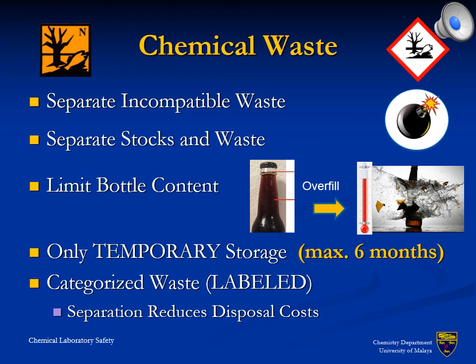Chemical waste must be stored in designated areas away from other chemicals. Containers have to be labeled according to the waste category immediately, and the date for the first waste collection has to be recorded on the container. The container must subsequently be disposed of within a maximum period of 6 months. Containers must not be filled completely with waste to avoid breaking upon warming. A 2-3 finger height reserved for air must remain.